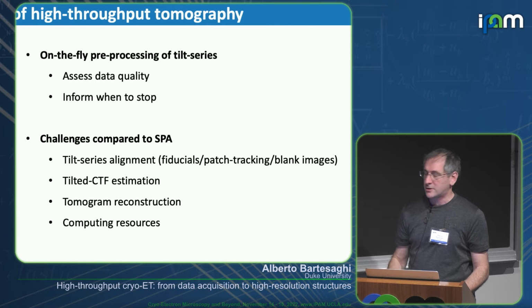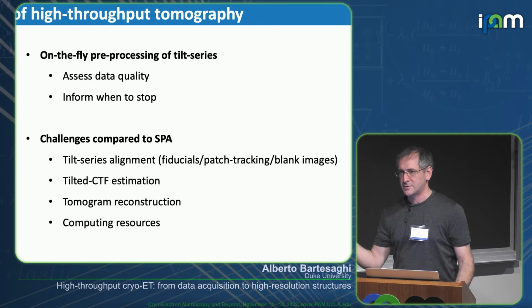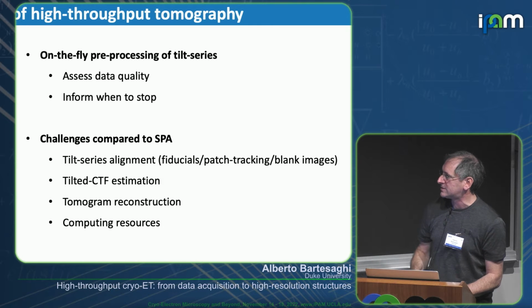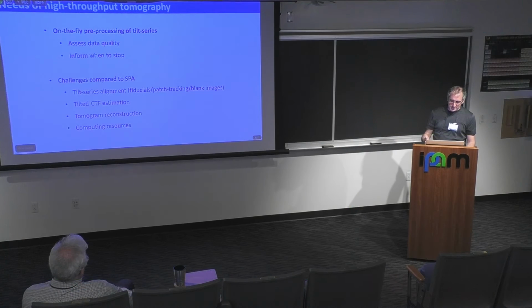CTF estimation is obviously a lot more challenging because now you need to estimate tilted CTF on each of the images of your tilt series. And the way we are doing that actually depends on the tilt series alignment. So if the tilt series alignment fails, you can't really estimate the CTF properly. And then you need to reconstruct your tomograms.